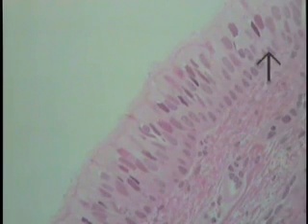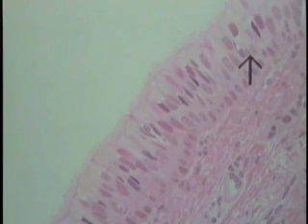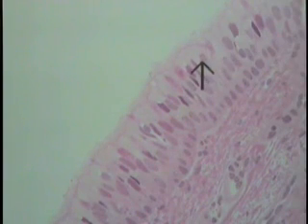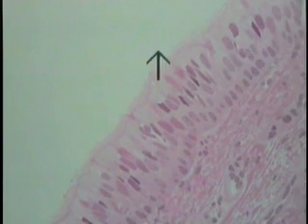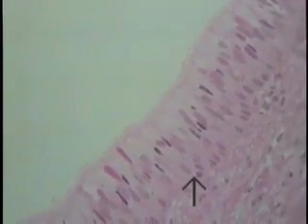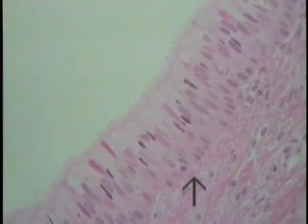One can easily make out the so-called basal cell layer, an intermediate layer of nuclei, again being traced by the pointer, and then some that occupy that upper or third layer. So this is how it appears in a much better preparation, where the section is much thinner. All the details look much crisper. And this phenomenon is true of most tissues when you compare a plastic embedded and a paraffin embedded section.